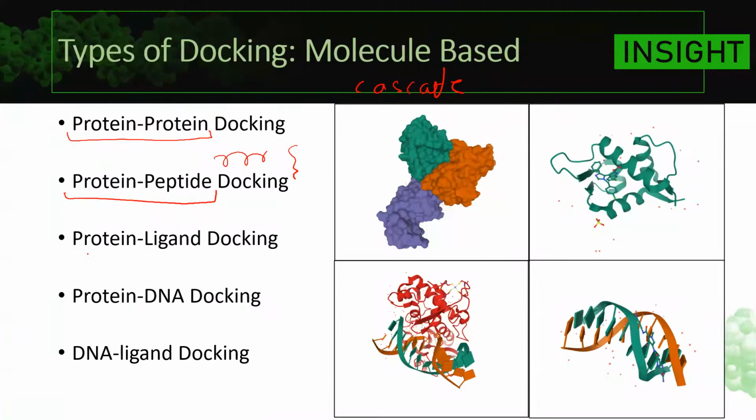You can also understand the interaction between the proteins and small molecular systems like drug molecules, inhibitors, modulators, or so many other types of molecules, or there could be chemical probes, there could be metal ions. So you want to understand their interaction with the biomolecular system. You can use the protein ligand docking. This is the most common type of study for which the docking is used to understand the interaction between the small molecule, which could potentially be the useful drugs, and their interaction with the proteins, which are the targets for different diseases. So this is one of the techniques we'll be discussing in much more detail, but others also we are going to discuss in different capacities.